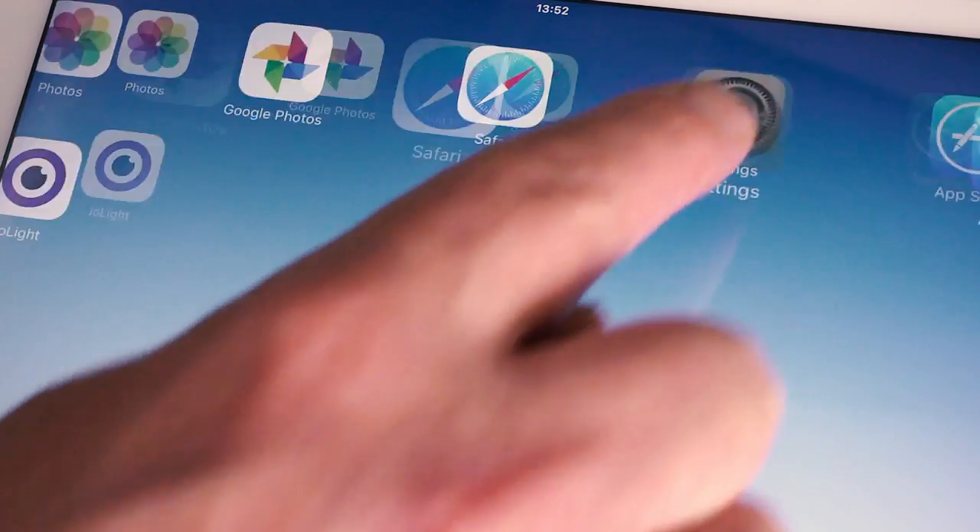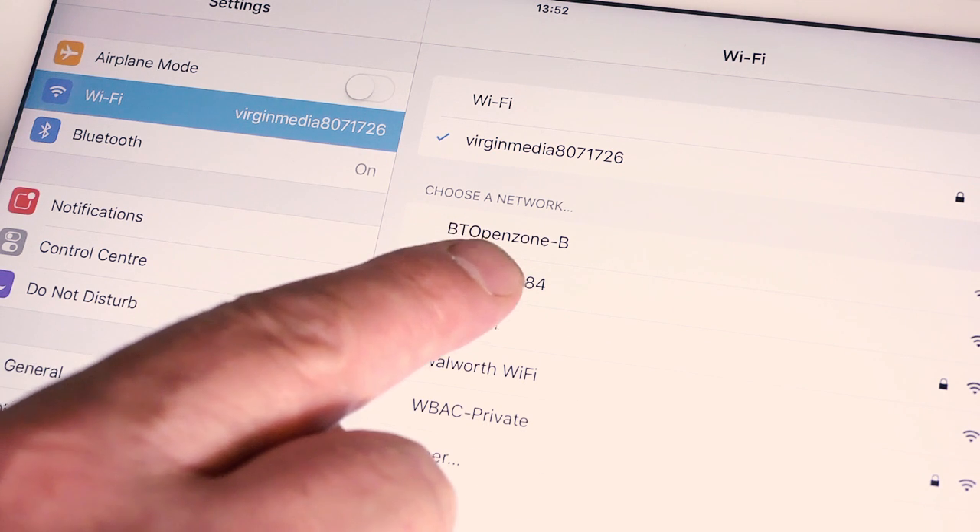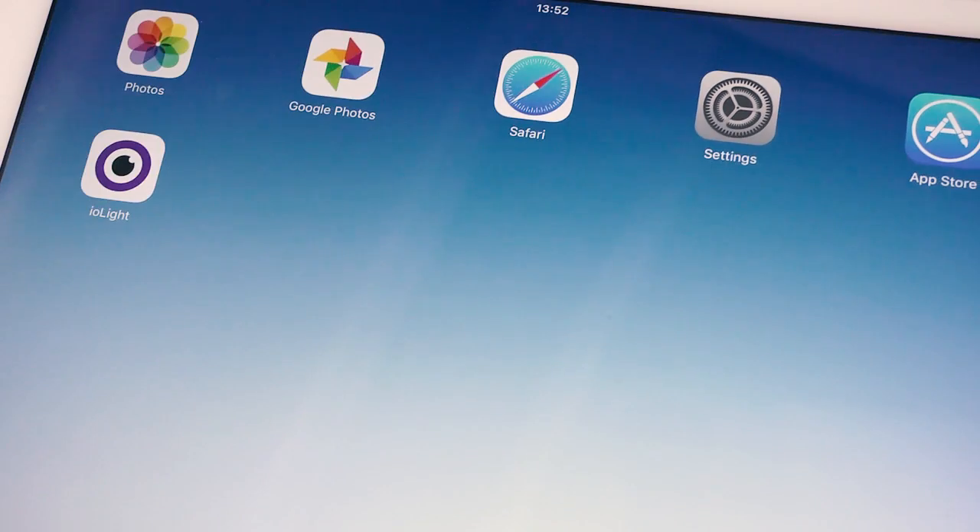The microscope makes its own wireless network so you don't need a Wi-Fi router. Go into the Wi-Fi from the iPad and there's the wireless network from the microscope, and we can open the Iolite app.